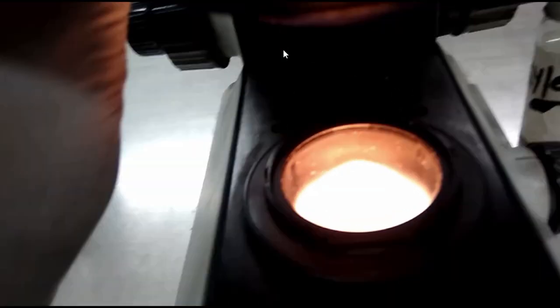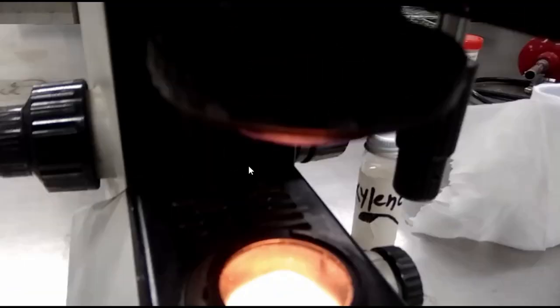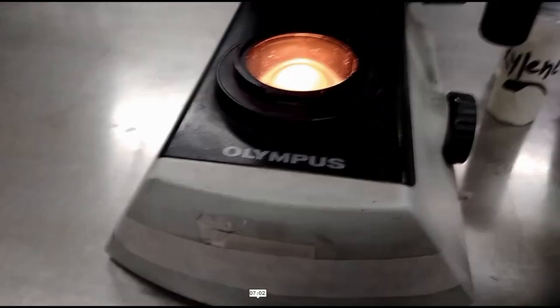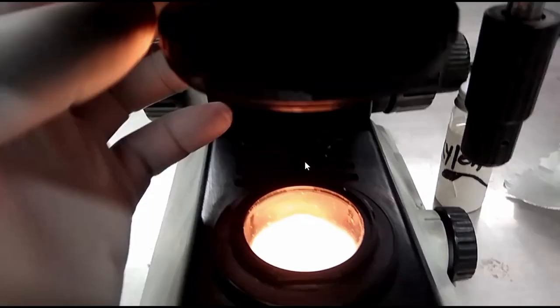Now about condenser adjustment. Here you can see the condenser adjustment system consists of focusing. It is done by moving the condenser up and down in this way. Here you can see the adjustment of the aperture in this way. And about the illuminating source, the light source is electric light.